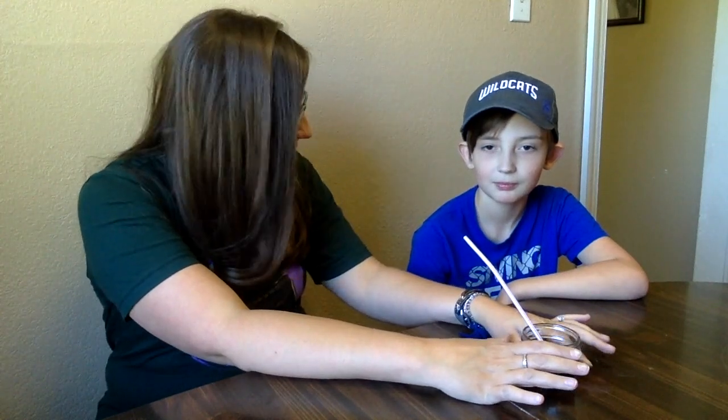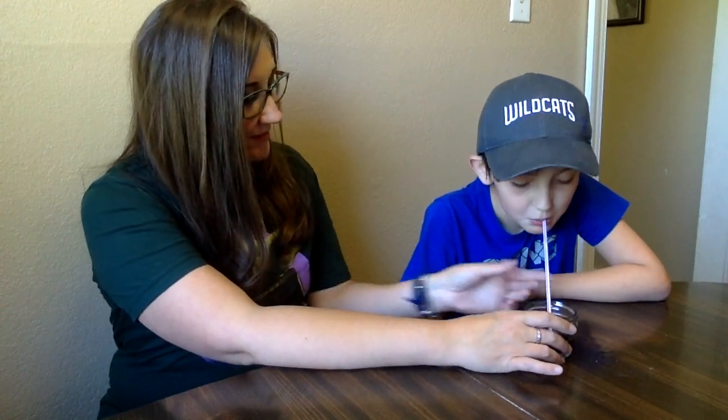So just so you know, we're doing this safely. He's just gonna blow into it. He's not gonna suck any in, right? No. Okay, good. And so we're gonna see what happens when he breathes out carbon dioxide gas into this. So while he's doing that, be thinking of what's gonna happen. So Liam, you can go ahead and get started. Very carefully blow bubbles.